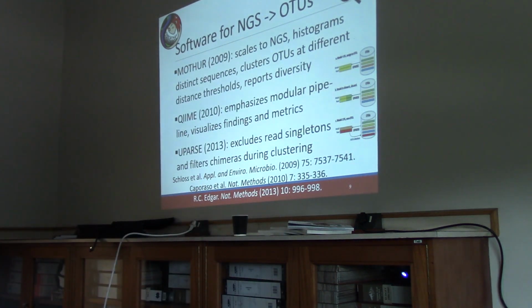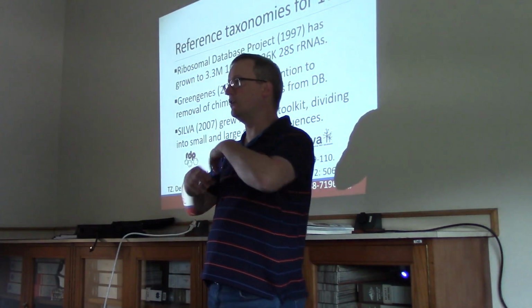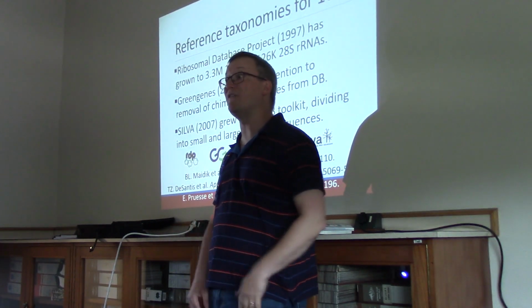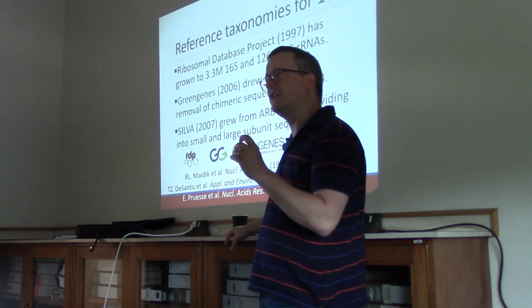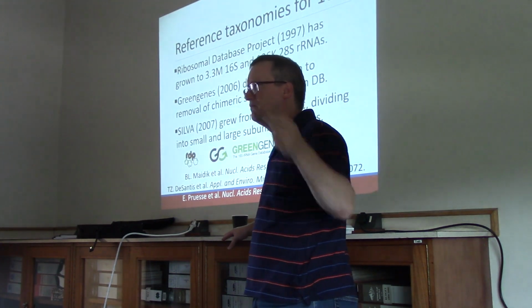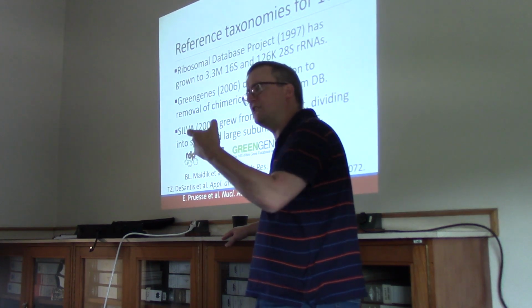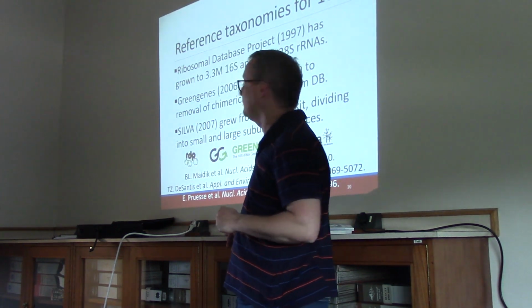All right, so these are brilliant tools just to get to a place where you've got your list of representative consensus sequences for each OTU in hand. Maybe you have hundreds of these things. Maybe you have thousands of these things, right? At the end, we still need to be able to say, what does this sequence, putatively from V3 of 16S rRNA, what does this sequence show us is present in this mixture? And for that, you'd better have a lookup table.